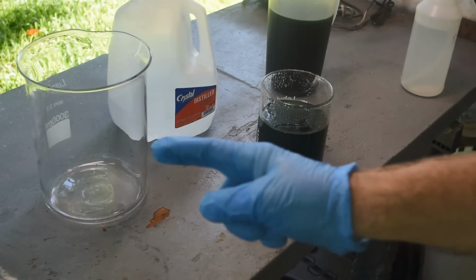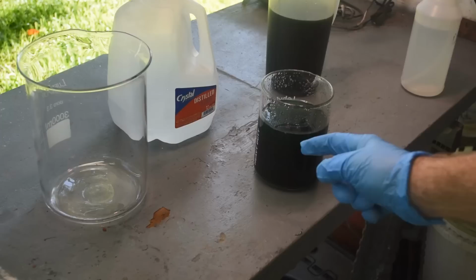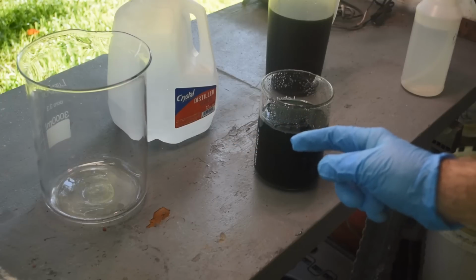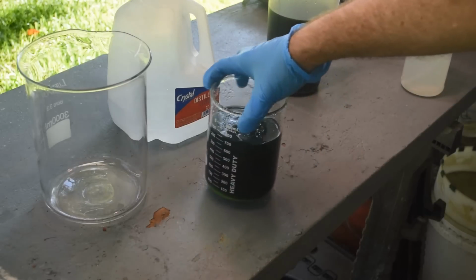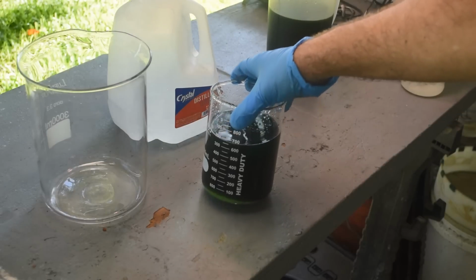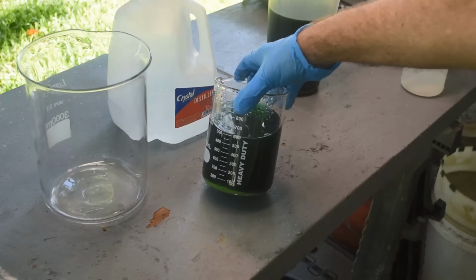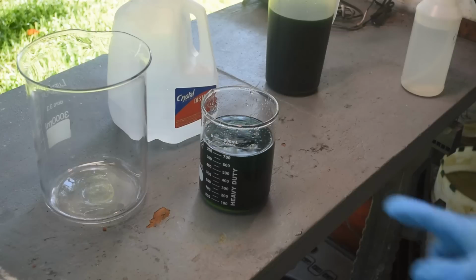All right, I washed the solids out of this big beaker into this smaller one with some distilled water. I pulled out the bigger chunks of broken glass and cleaned them off. So this contains a lot of distilled water and all the solids from the bottom of that beaker. So as you can see, there's some solids down there that are not dissolving, at least not yet. But this is all room temperature.